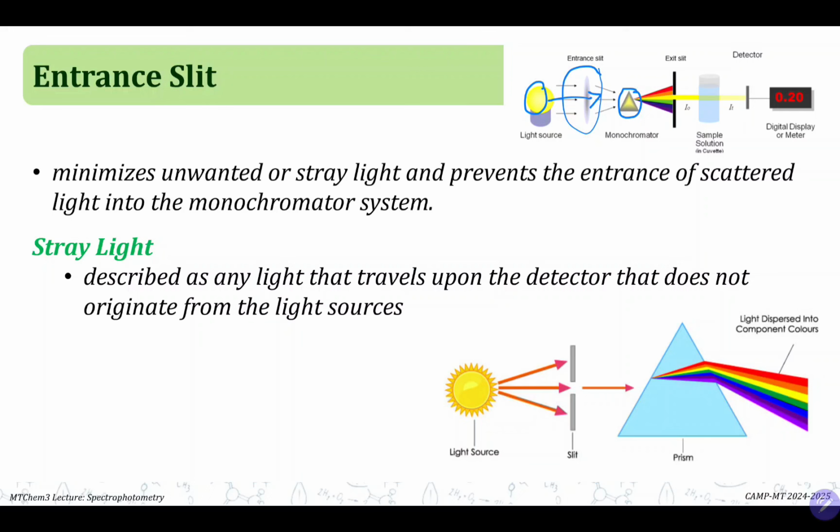Okay? Now, your entrance slit, again, minimizes or removes any unwanted light, and that is known as your stray light. That is described as any light that travels upon the detector that does not originate from the light source. Stray light yung mga ayaw nating nade-detect. Okay?